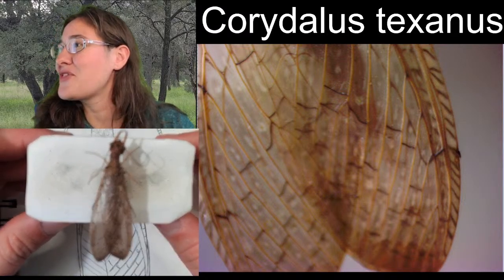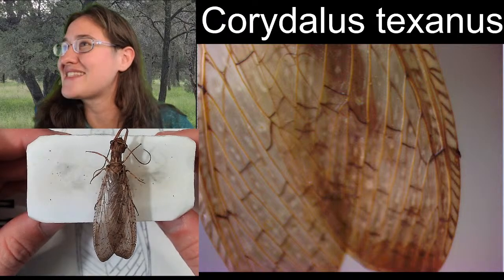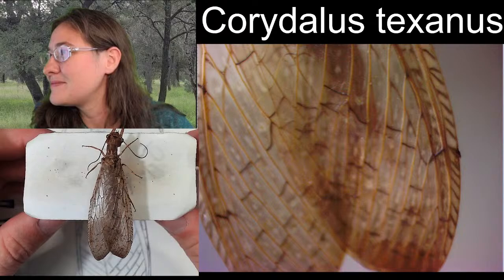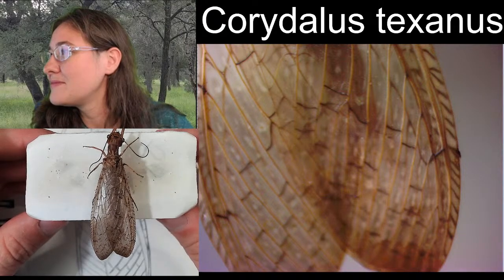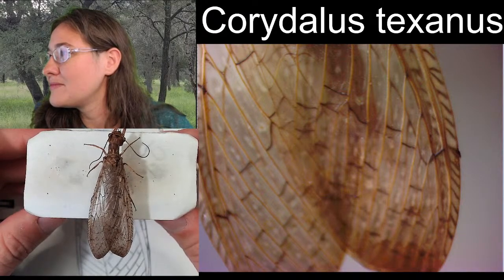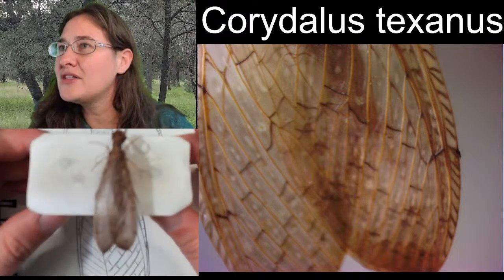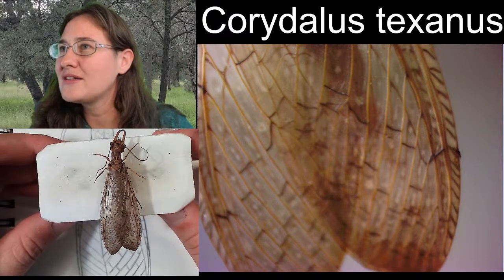You gotta hit it with a little beige paint so you can draw the dots. That's a really good idea. Does this help at all, looking at it this way?